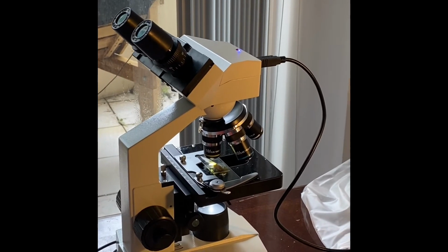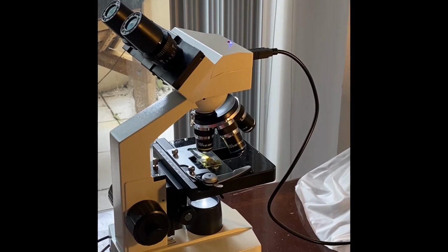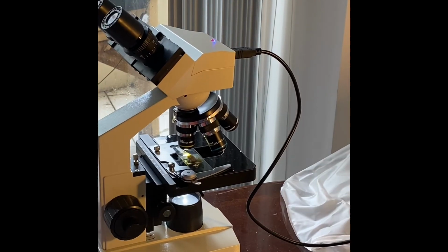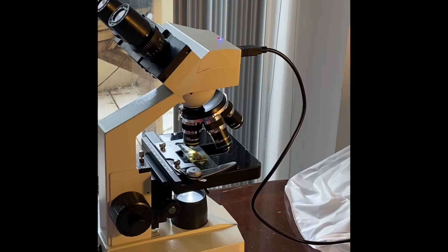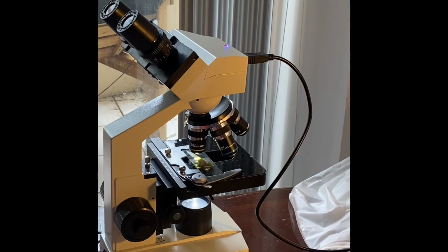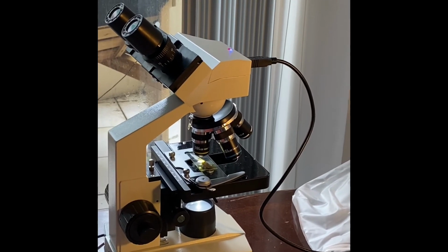Take out your biology notebook. Label the lesson on onion cells. Draw the onion cells as seen under your microscope. I'm looking at what all of us should see under our microscope. There are many cells here. Remember, many cells means multicellular. And there are many nuclei here, more than one nucleus in the picture.